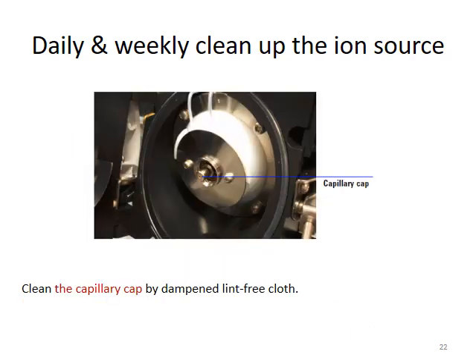Without breaking the vacuum, you can remove the spray shield and the capillary cap will be exposed. Here shows the capillary cap. You may clean the capillary cap with a dampened lint-free cloth. If you would like to remove the capillary cap, you have to vent the instrument.